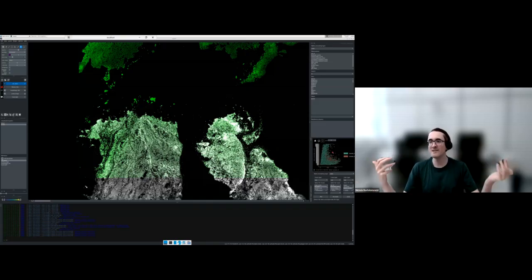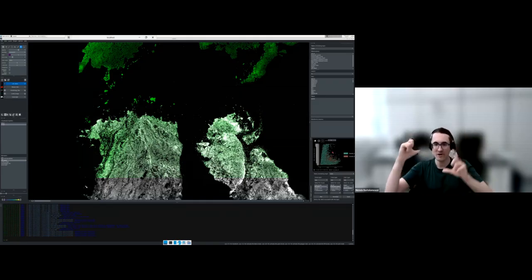You could see this as a way to perform something like a manual gating, like people used to do for their flow cytometry analysis, for instance, as a quick and rough way to do some manual annotation to explore things further.